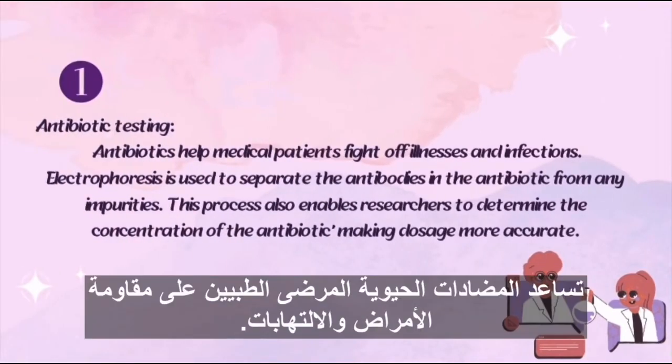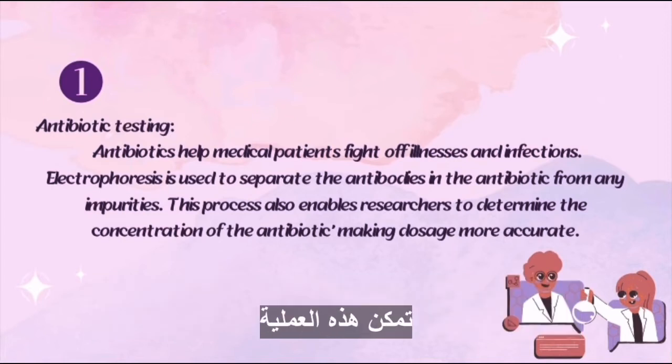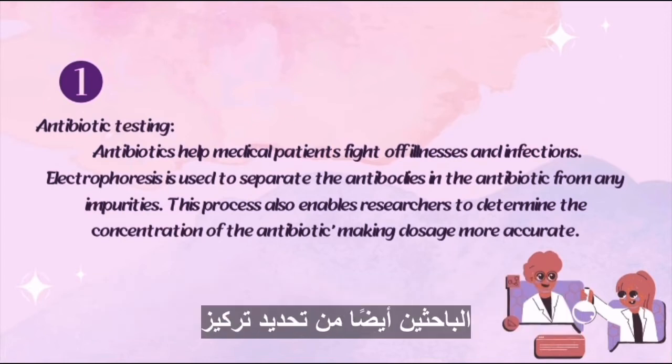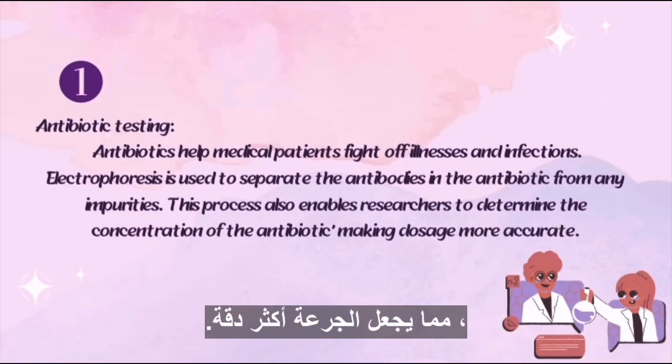Antibiotic testing. Antibiotics help medical patients fight off illness and infections. Electrophoresis is used to separate the antibiotic from any impurities. This process also enables researchers to determine the concentrations of the antibiotic, making dosage more accurate.